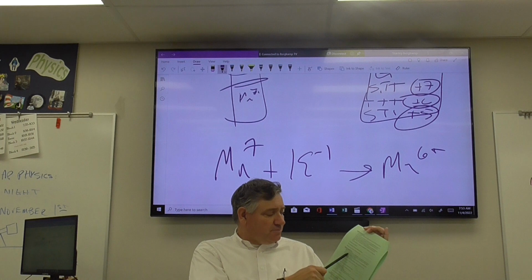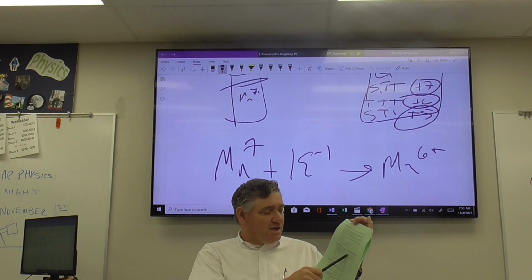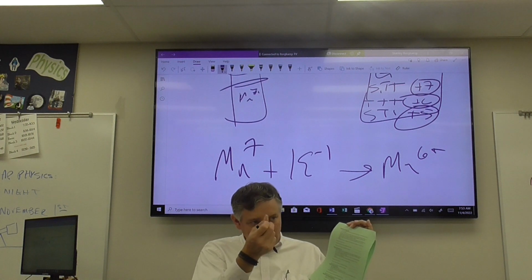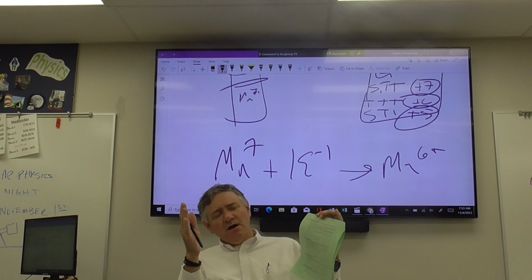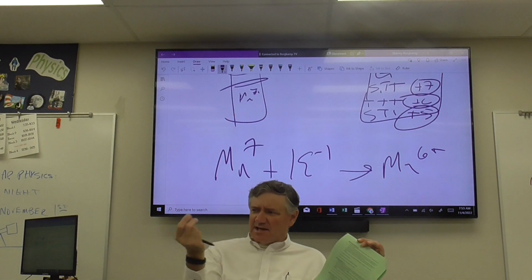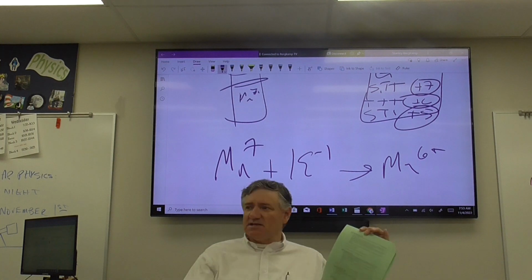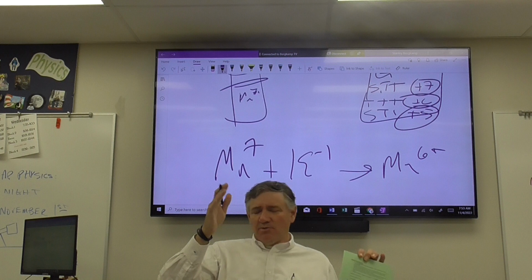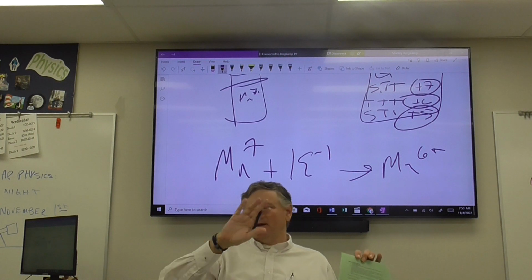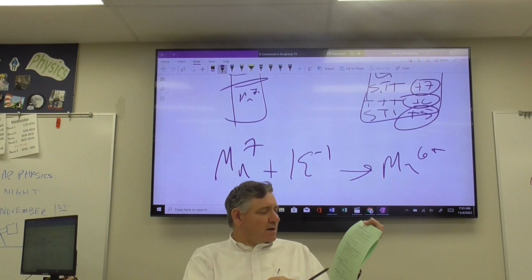Now we're down to a specific amount again. You're going to measure out 2.01 grams of MnCl2, manganese chloride, in a weighing dish. It's like a pink granular substance. Most of the time the powders that we deal with are white. This is kind of a pinkish orangish color. Notice that it says 2.01 grams. If you can't get exactly 2.01 grams, don't flip out, but try to get it as close as you possibly can.